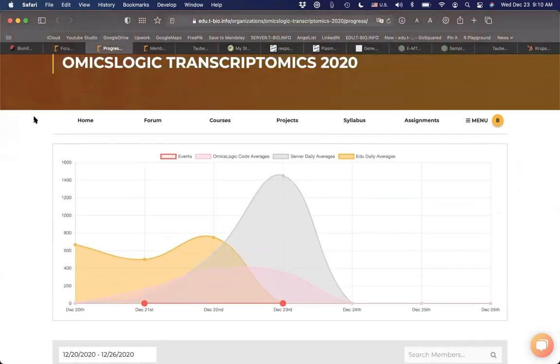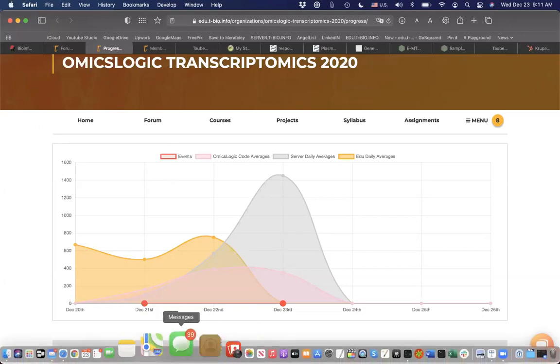So all of that, I think, shows that as we approach the stage of defining a data set and trying to apply the tools to this data set, you're probably getting familiar with a lot of these methods and what types of applications there are for the different types of analysis and different stages of analysis. So I think that's good.